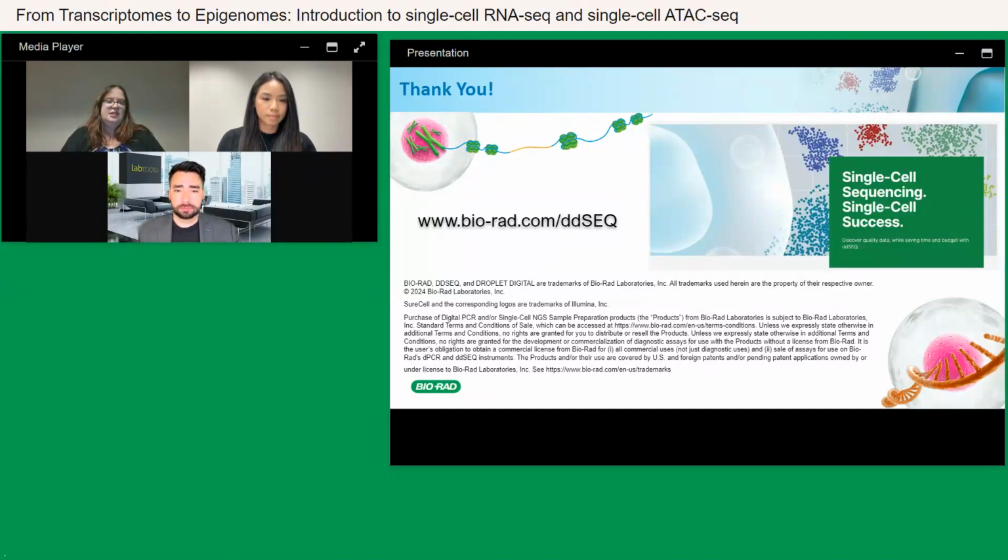In the case of the single-cell ATAC-seq kit, we're looking for those sequencing reads that contain the same start and stop site positions between two different beads. For one bead, we get all those start and stop positions and compare that to all the other beads in the sample, and we count how many reads are matching and how many aren't.